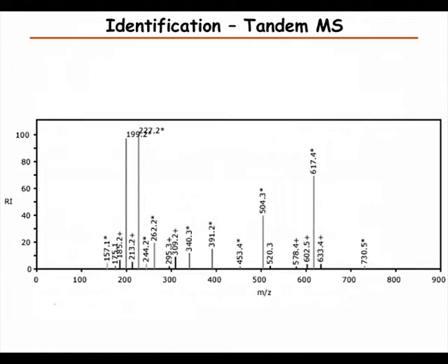While you do that, I'm going to talk about how to do this in a more manual way. Since we have a fragment mass spectrum, if we're going to interpret it, there are two ways to do it. First, we're going to assume that we know the sequence, and see if we can understand the spectrum and explain all the peaks.